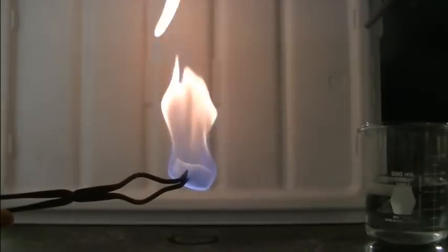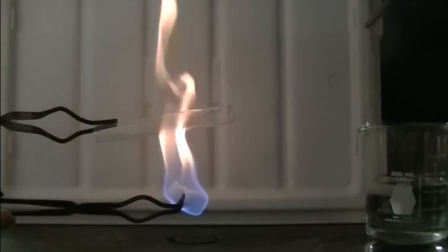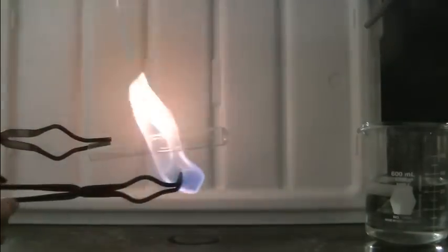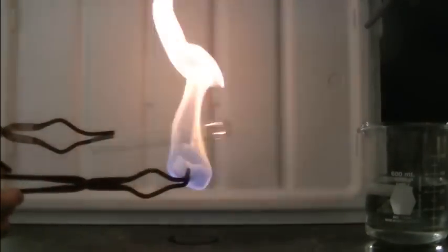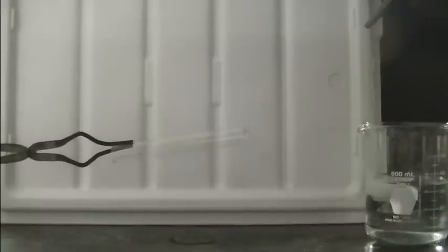Once again we can do the test tube test to look for the formation of soot. And what we recognize is that even though the flame was quite yellow there's not much evidence of soot formation. So even though we saw evidence of soot formation in the burning of the ethanol there's not enough soot being produced to form a lot of residue on this test tube that was placed in the flame.